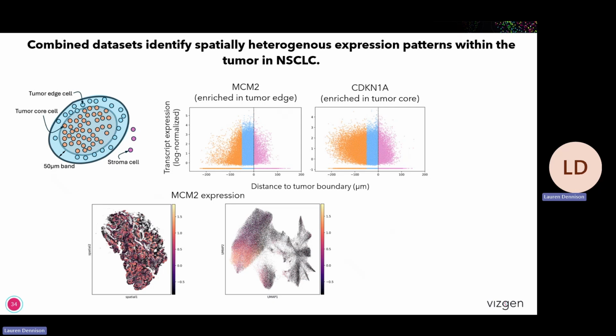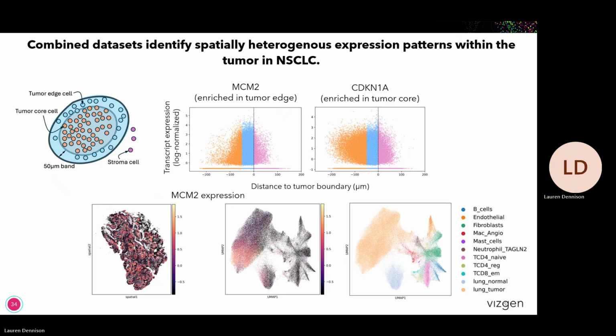And that is also interesting because it means that MCM2 is not a technical outlier that somehow cells in this tumor band express, but it's more likely to be part of a gene expression program because overall in gene expression space, cells having high MCM2 expression clustered together. This is for reference the tumor cells again. So it's the same positioning of cells, just the color code changes.